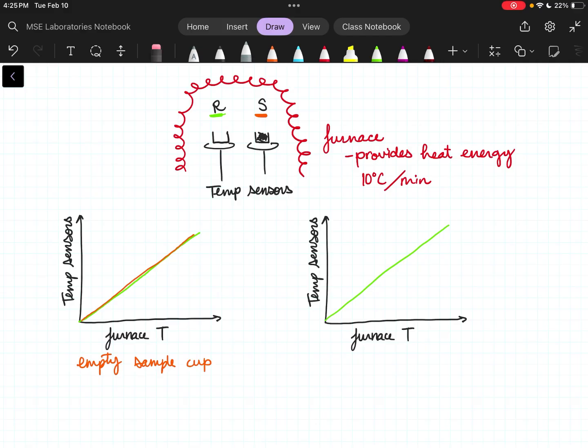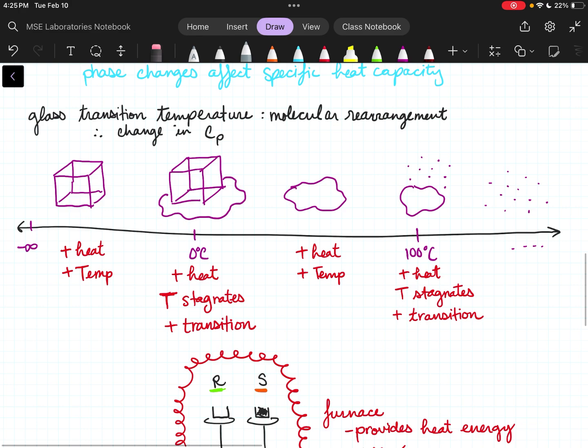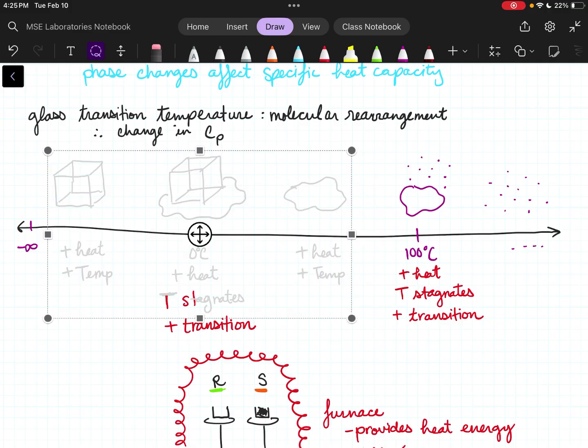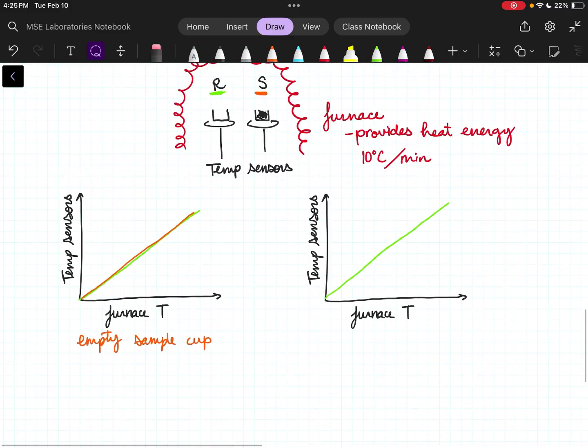And we know that my reaction, let's say we're doing this reaction right here, where we start very cold, we melt the ice, and then we go up to fully melted. I have different parts of my reaction. So let's say the temperature here, let's say this is what we call T melt.